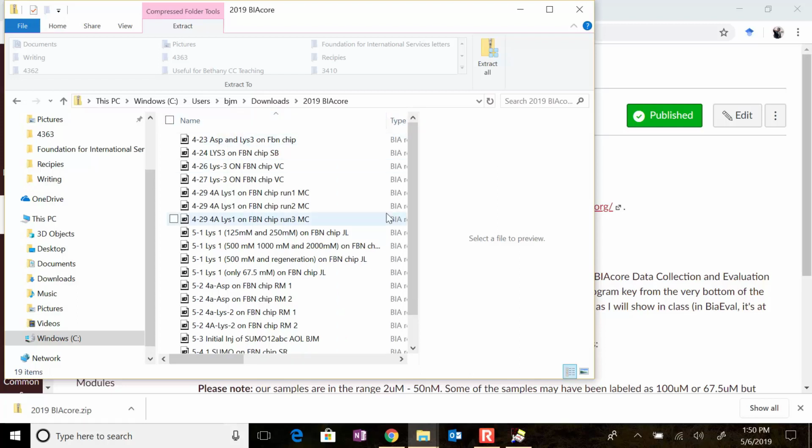This is why it's helpful to have the date in there, because the date doesn't always carry across on the file timestamp. But you can see right there, there's all our data that we've collected. If somehow it ended up saved in a different place and you need me to pull it off, just let me know. But we've collected a lot of data so far. I want to look at the first file right here, the 423.